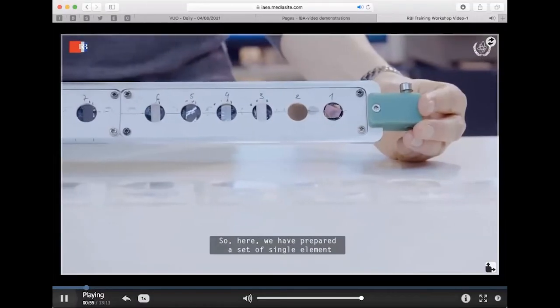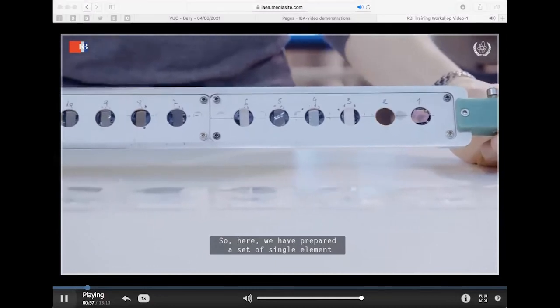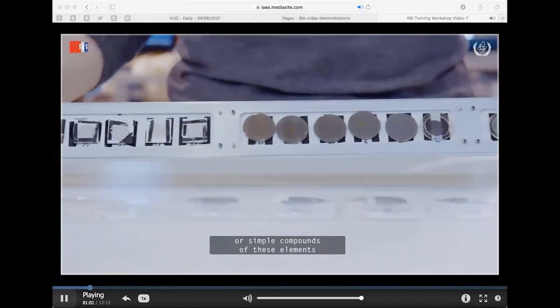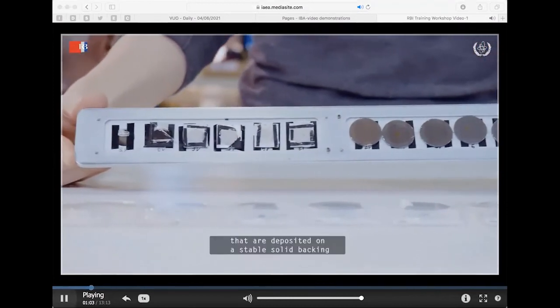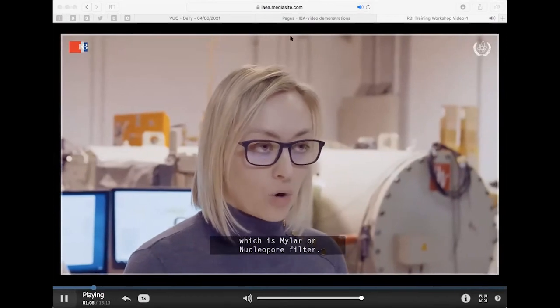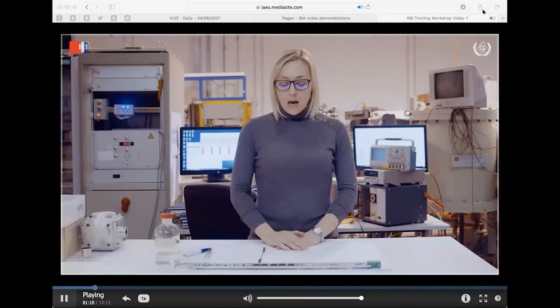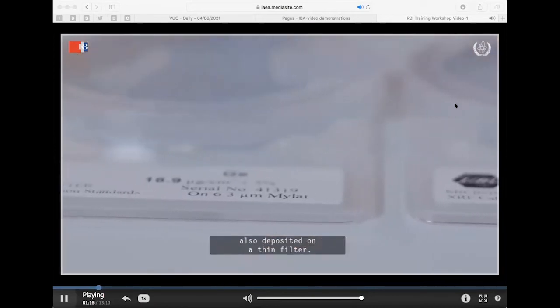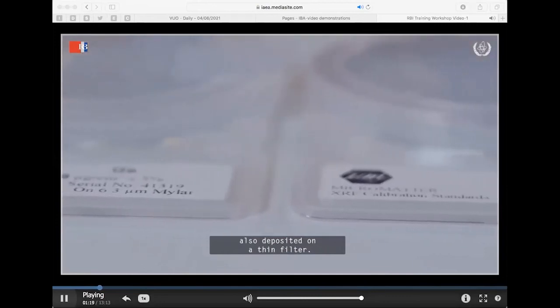So here we have prepared a set of calibration standards, either single element or simple compounds of these elements, that are deposited on a stable solid backing, which is a Mylar or Nuclepore filter. For the verification of the calibration, we have prepared a multi-elemental certified reference material, also deposited on a thin filter.